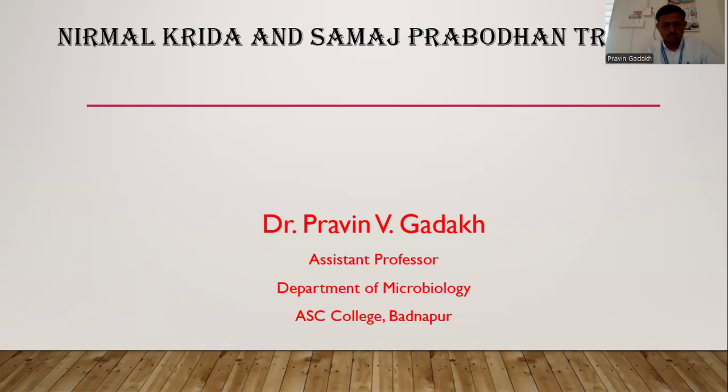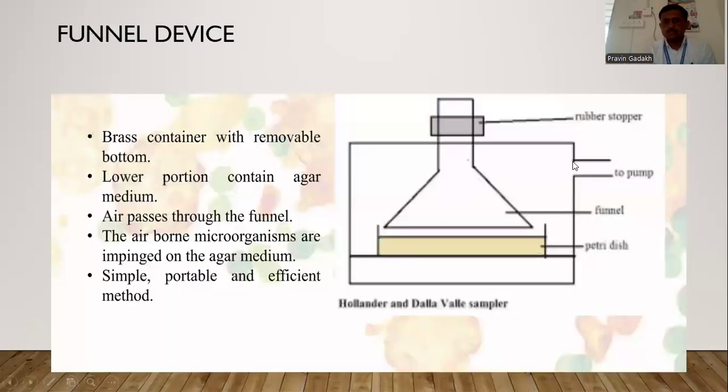Hello, dear students. In the last lecture, we discussed the different air samplers with respect to solid impingement devices and liquid impingement devices. In that, we discussed what the different solid impingement devices are, and the settling plate method in the case of solid impingement devices. Now, in this lecture, we will discuss the funnel device, which is part of the solid impingement method.